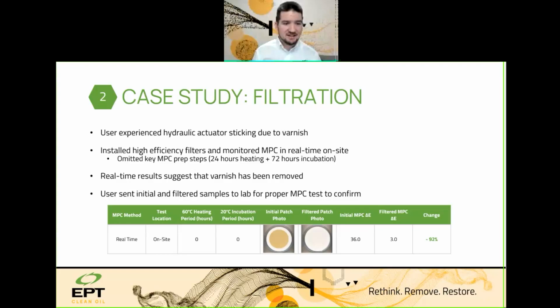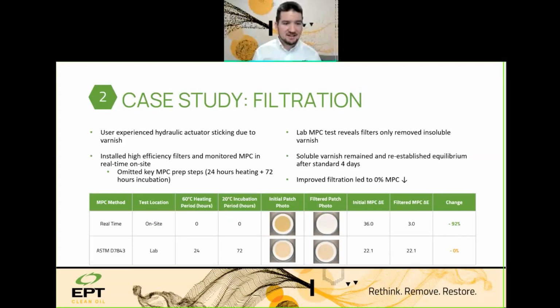What happens when you do? Well, they sent duplicate samples off to their commercial lab to confirm the results, and imagine their surprise when they came back completely different. So what is going on here? The patch on the top right, this white patch, why isn't there any varnish on it when 72 hours later, if you let it sit for that 72-hour period, there is?